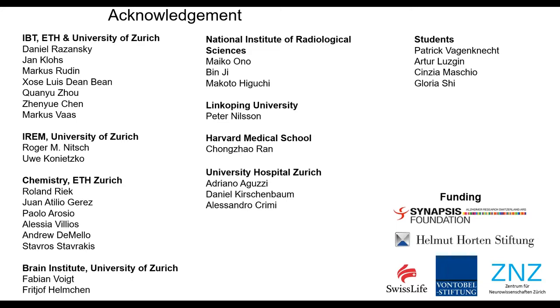Okay. A further question is about the lovely 3D imaging. I think this is more of a technical question. The 3D cup that was used here was developed by Daniel Razansky at Zurich. The 3D imaging wasn't performed on the InVision system, the commercial system, but I would point out that from iThera, a variant of that 3D cup is available that does work on that system, developed from the design made by Professor Razansky at Zurich. So the system that Ruiqing was using is a combination of a commercial system and a homemade system, and the homemade component is available with the commercial system now.